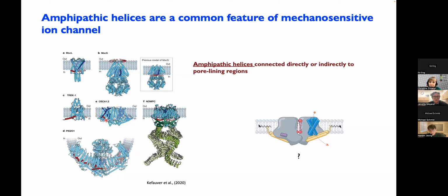Let's see. And then we have one here. Is amylamine a standard go-to additive for helping with ice thickness and particle orientation? I think it's known that it helped with the particle orientation, at least for the example that he showed with negative staining. I haven't personally used it, but we also can't really dedicate an entire setup just to doing that, like he said you need to do. So, if you have anything else to say.